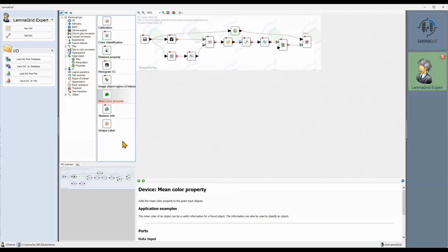Let's return to the single plant example of the last video. Here we don't need to add any row affiliation whatsoever.